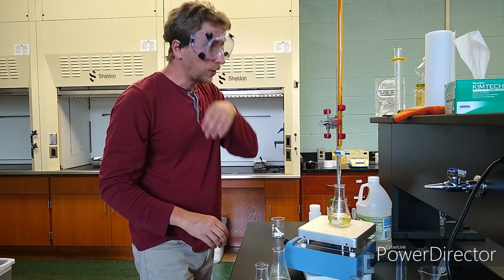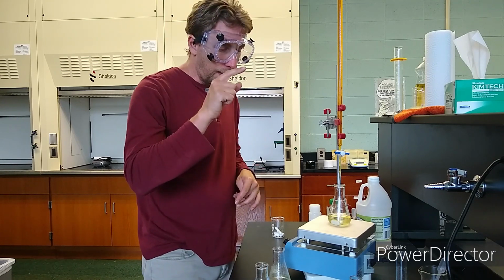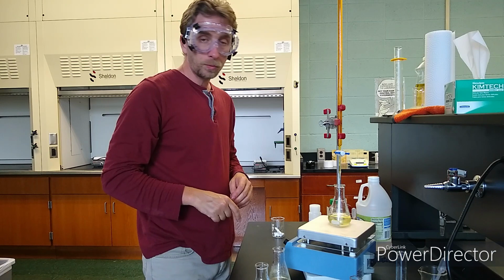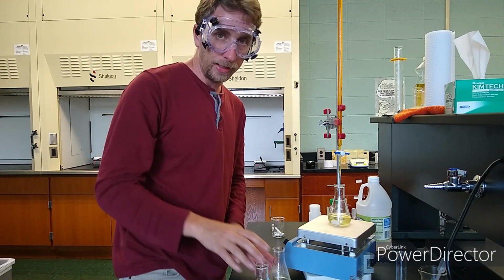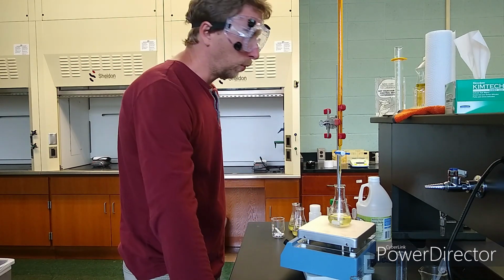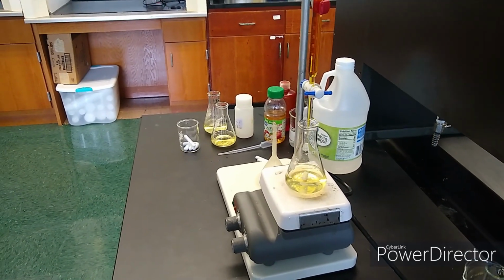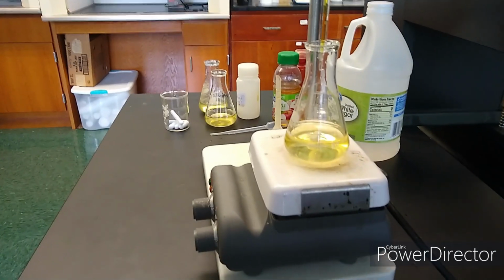So, we're trying to add the iodine up until it turns purple and stays purple for at least 30 seconds to a minute. But I've got to get a better stirring plate than this thing that's all catty corner. So hang on 1 second. There we go. Isn't that a better fit? Okay, so I'm going to put you all down close here to see the action.